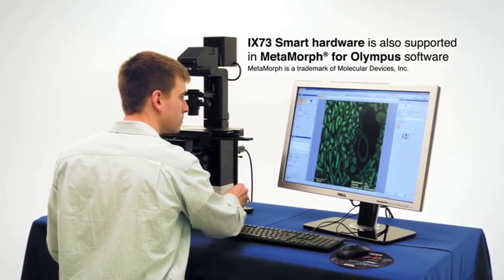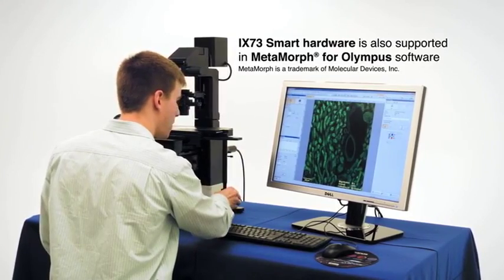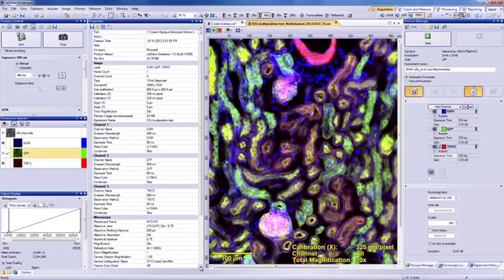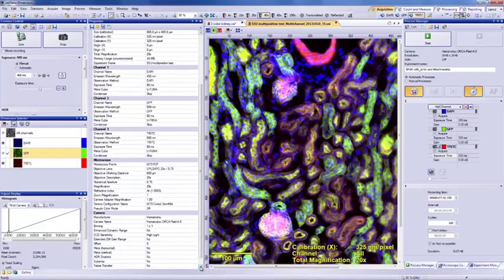The IX-73 Smart Microscope is a manual, coded configuration that knows exactly what adjustments the user has made during operation. This information is saved into the image metadata, or experimental parameters, for future analysis.